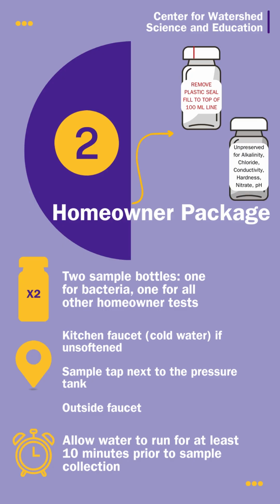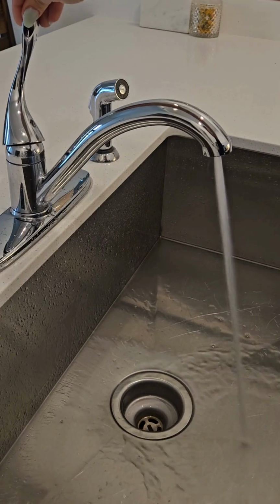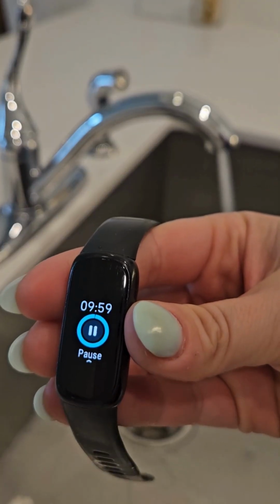Before collecting the bacteria sample, thoroughly wash your hands with soap and water to reduce the potential for any contamination. Be sure to use an untreated faucet with all of the attachments removed per the previous instructions. If you are using the kitchen faucet, make sure the tap is all the way onto cold. Run the water on high for at least 10 minutes to ensure that the water is coming directly from the well. A good indicator of this is the well pump turning on.